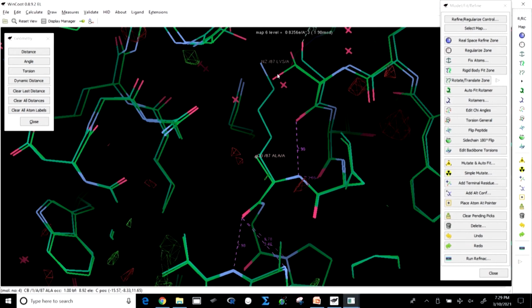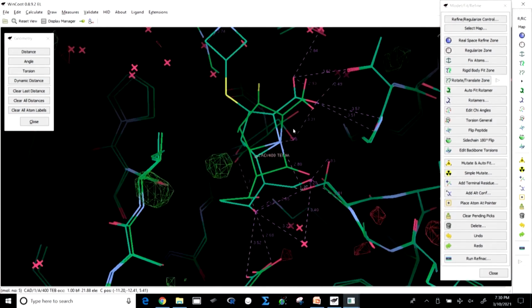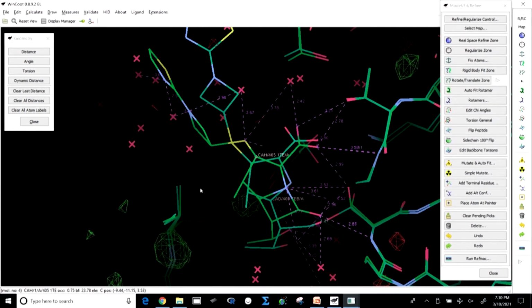which goes and holds the serine in a particular position, and now the serine not only loses the proton, but becomes ready to do the reaction. So, this is not only showing us, but also giving us the mechanism. Also, as I told, the distance.